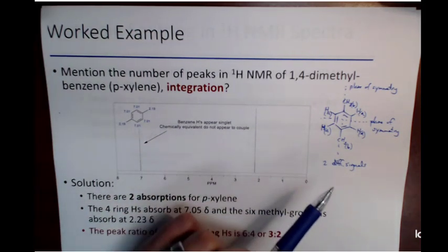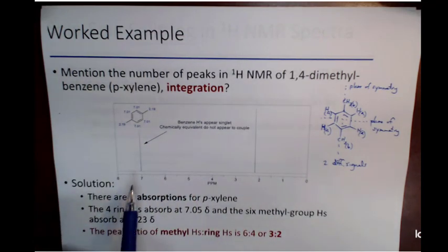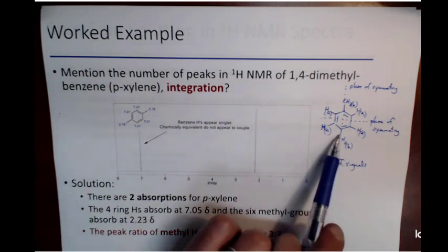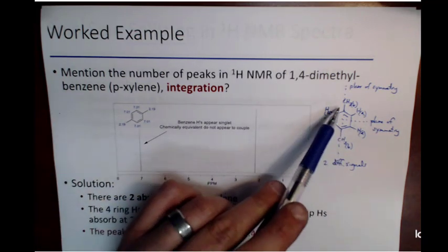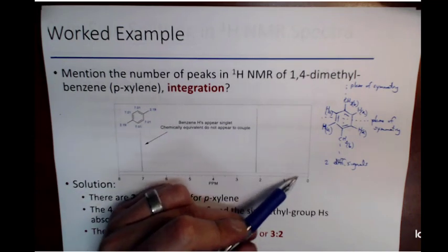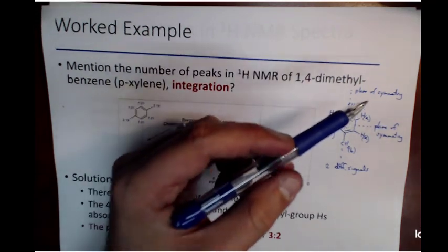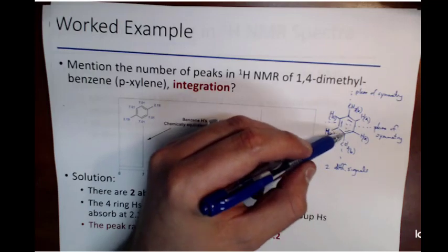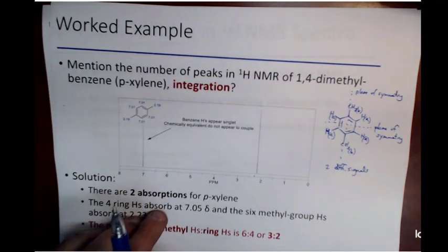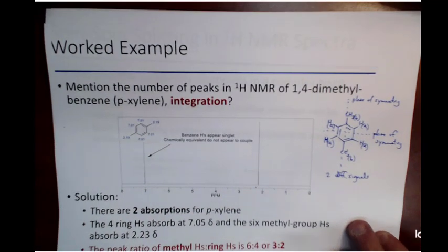Okay, and so as I said before, the hydrogens on benzene are very distinctive. We see them quite frequently somewhere in the 6.5 to 8.5 region, and so that's what we see there. And then here are the methyl hydrogens. This carbon is attached to a benzene ring, so they're not really in that aliphatic or alkane region. They're pushed out more because, if you recall, these hydrogens, based off the double single bond, do look like allylic hydrogens, and so that kind of falls in that region. All right, so there's an example there.